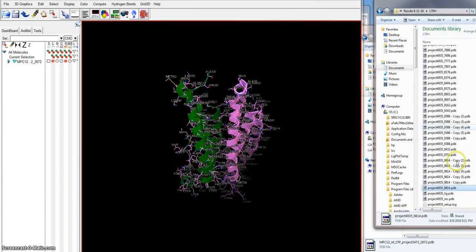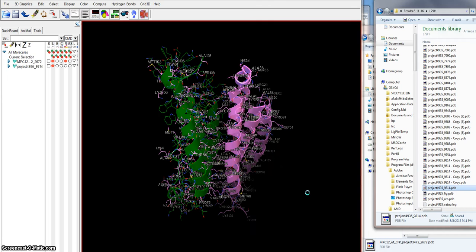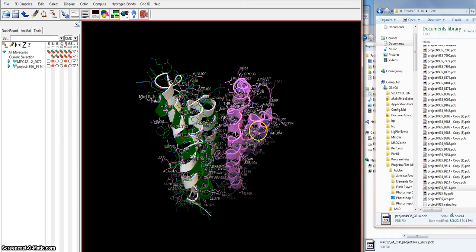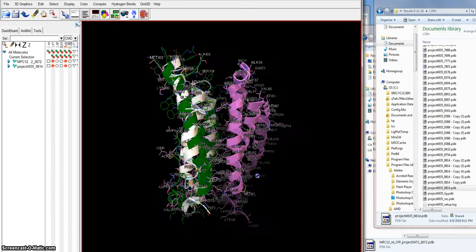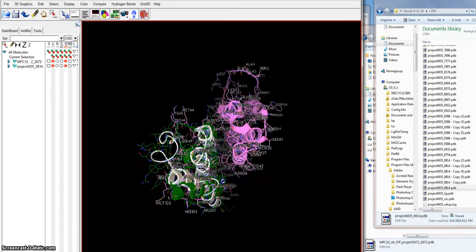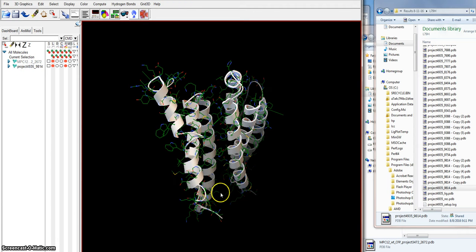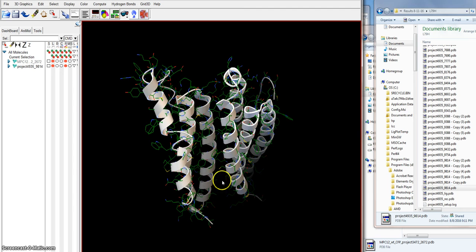Unfortunate situation in this one is I'll drop in this one here. I've got multiple copies. None of them oriented just right. Now I can do the ribbon for the one I just dropped in. So you can see the MPC2 is a complete overlap, right? There's our hanger. And then we can see it almost looks like this is just right, but when we hide the original molecule and we come in, we see the Cys 60 and 61, but actually you'll find that it's oriented in the wrong way.